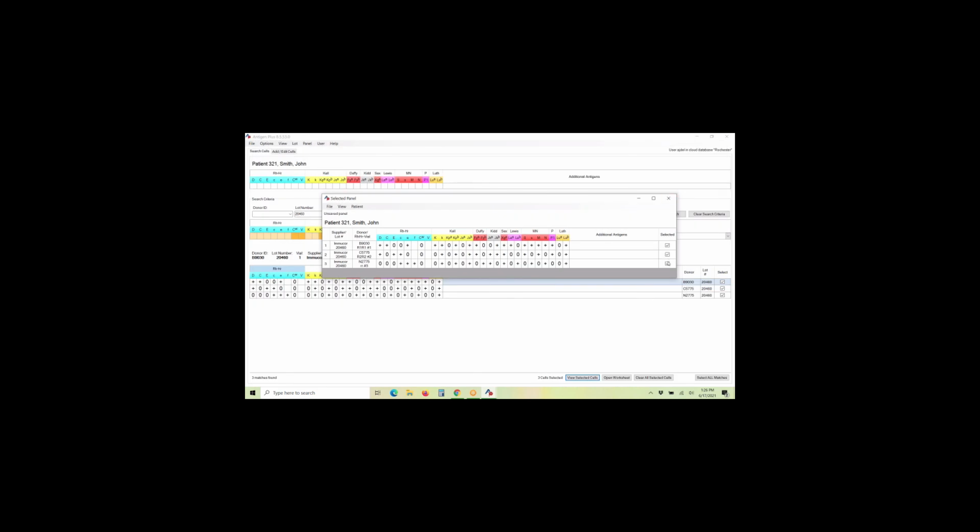You can remove cells from here if you want to remove them from here as well. But for the demo, we're going to go into opening the worksheet. So just know in all the demos where we're doing manual cells, you could do those features. When it's coming from the instrument, you don't have that option because whatever comes from the instrument has to stay in there. You can't really change those. You have to make a new column with whatever results you want to edit.